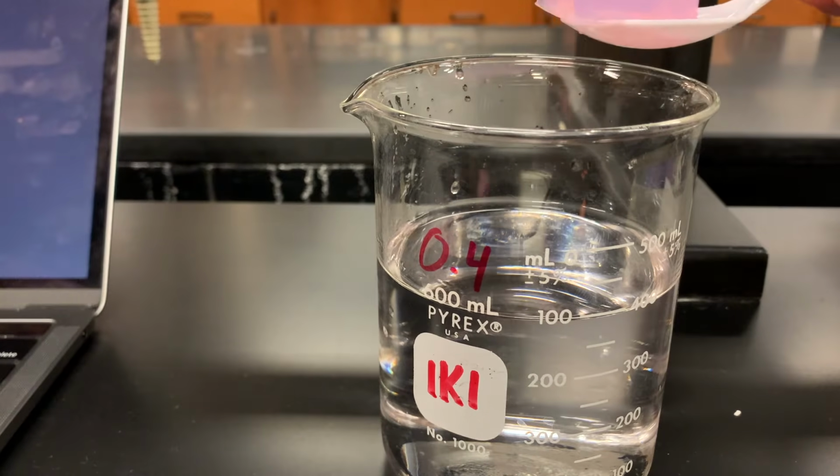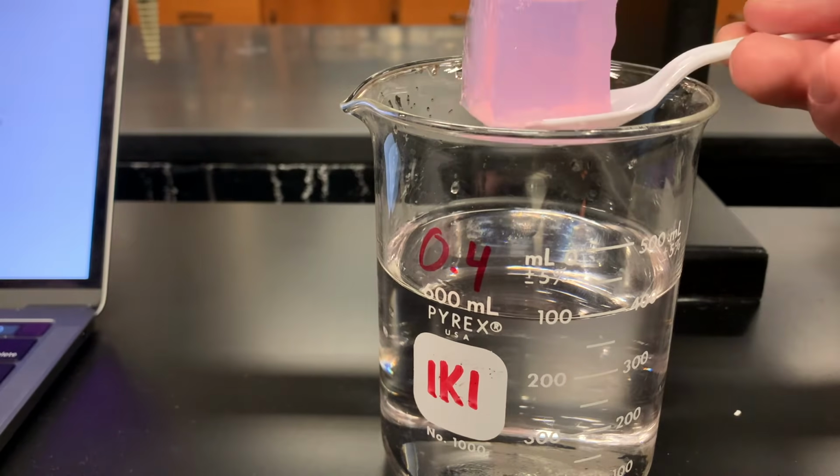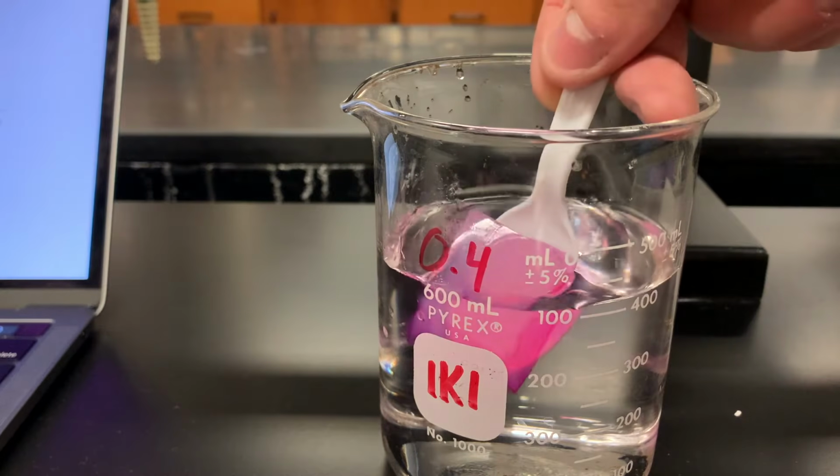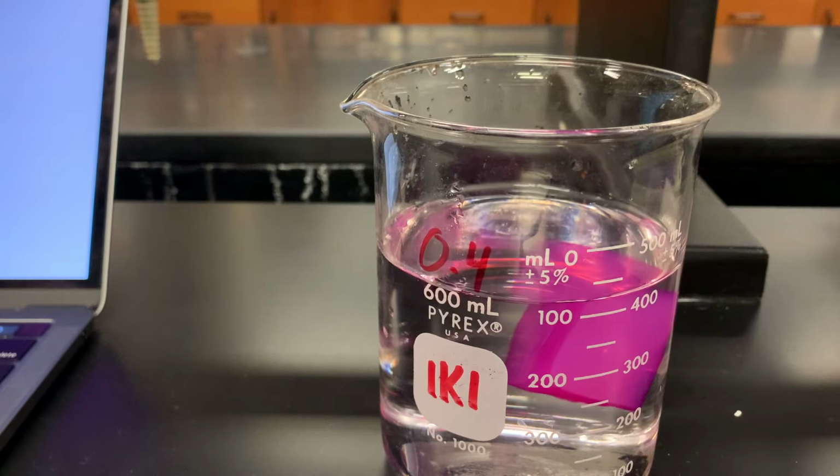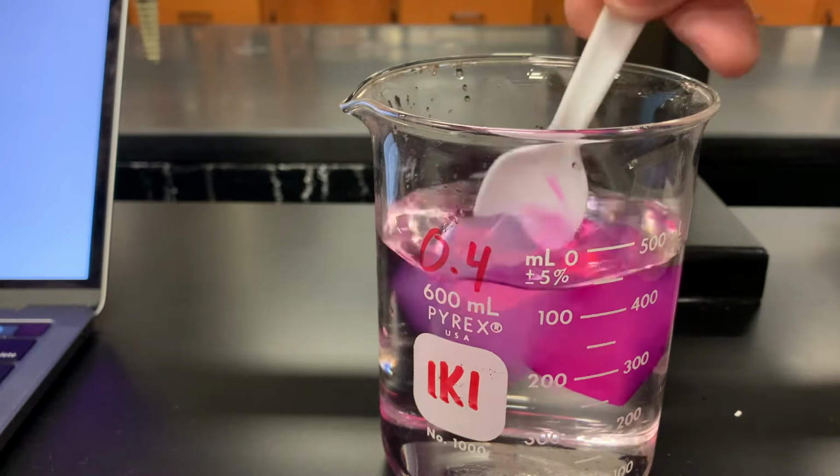Why I'm doing it with the 3 centimeter ones first, guys, is just so they don't, if I put them in last, they're gonna crush the other ones. So put the biggest ones at the bottom.